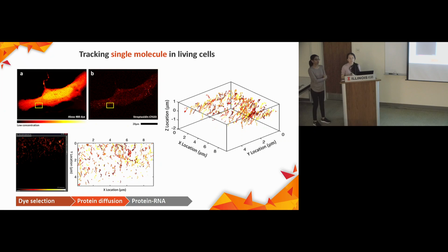That's a good question, but I would still think the bleaching of the MINFLUX is very mild compared to any other microscope I've ever used. So I'm not worried about the bleaching effect too much on the MINFLUX system, and the sample stays very bright throughout the whole image.